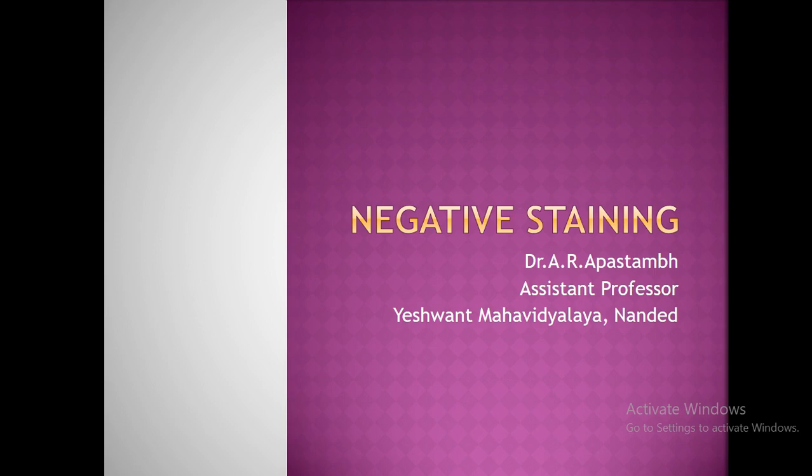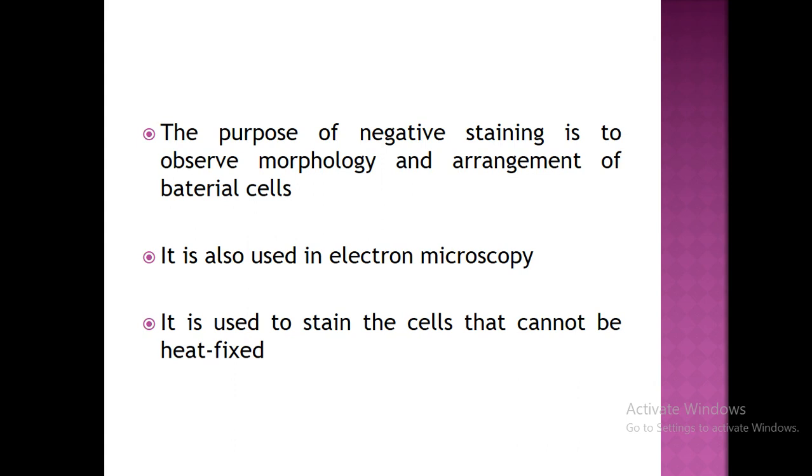Good afternoon, friends. Today we will discuss one important staining technique in microbiology that is called negative staining. The purpose of negative staining is to observe the morphology and arrangement of bacterial cells.